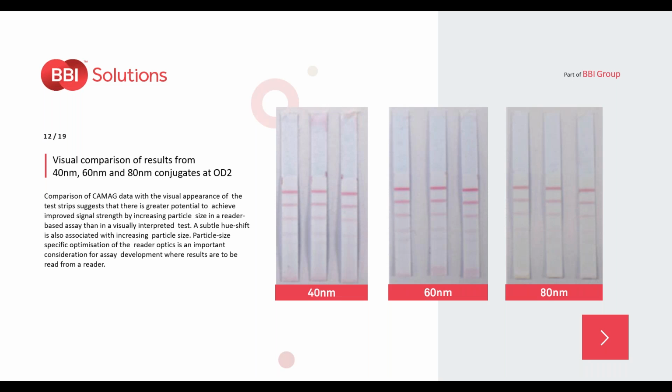Okay. Also, you see a subtle hue change. You see the color change a little bit. So from the 40, we've got that nice cherry red color. On the 60, we're getting a more purple color, but it's very defined and it's very controlled. And then as we move towards the 80, we're getting a slightly browner color, which doesn't really help with visibility on lateral flow strips.